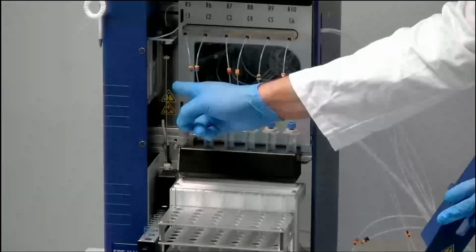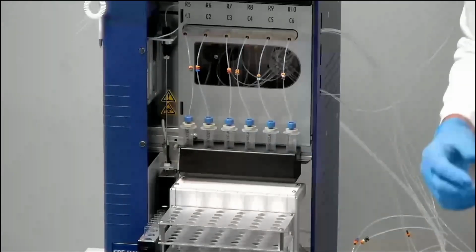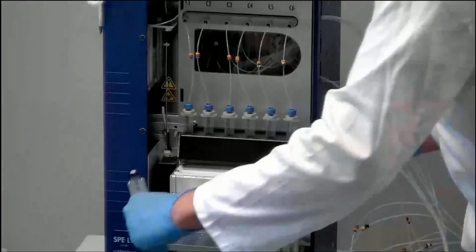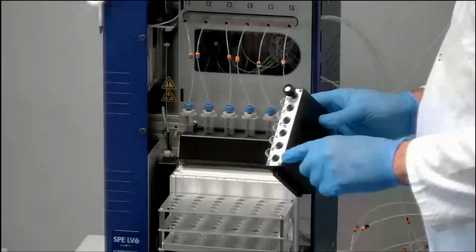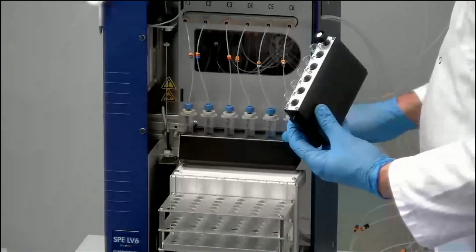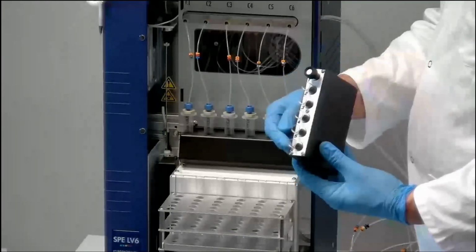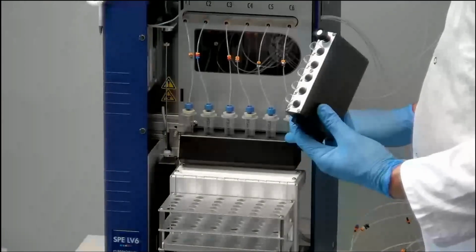So here you have the needle, and the needle will take your sample inside a rack. Here you have a rack with 6 positions linked to each position that you have here. That's why you have different numbers like 1 to 6, which correspond to the position on your system.